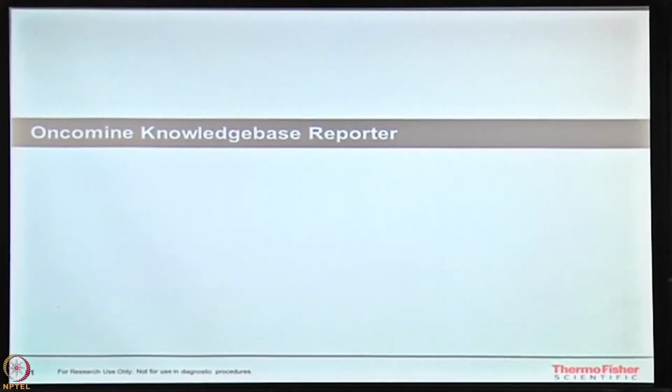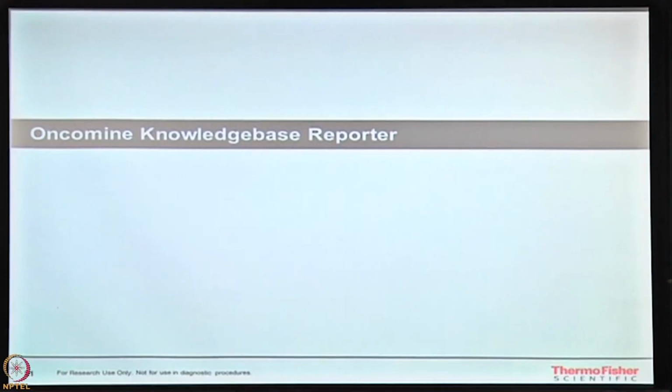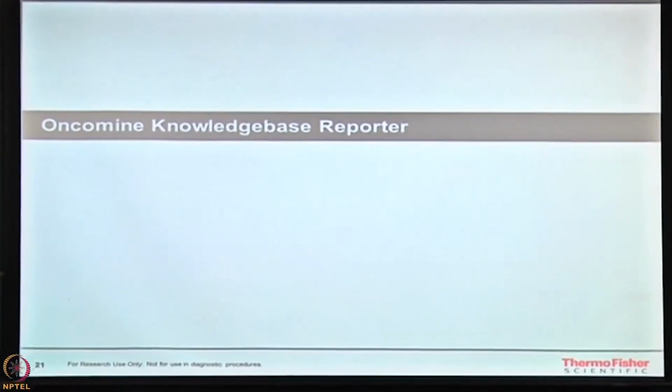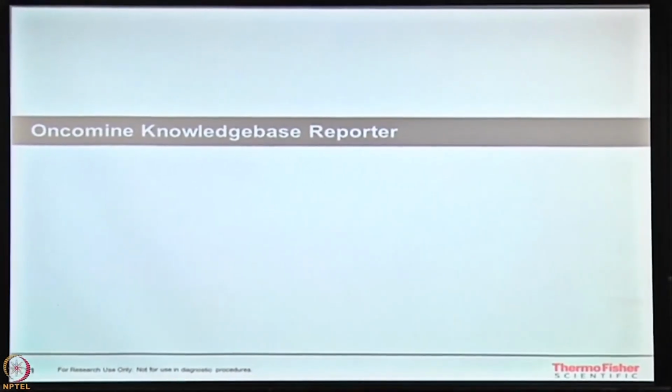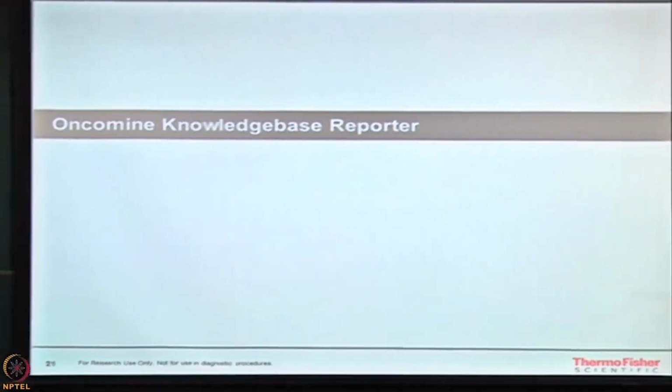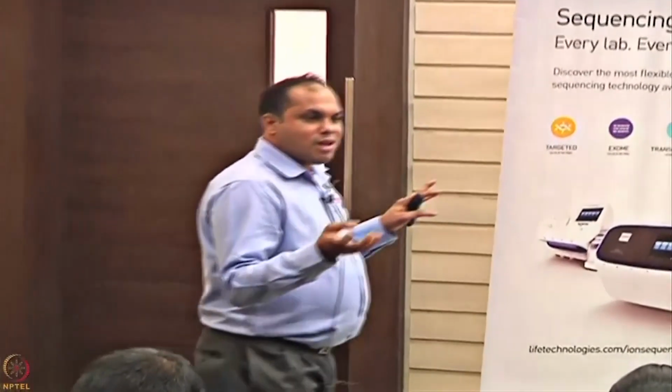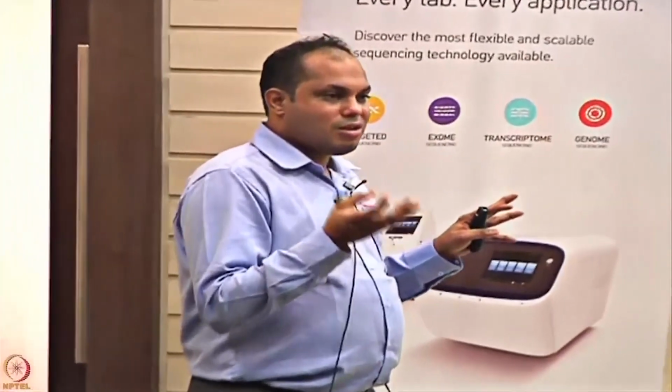And then what could be the drugs which could be available for such diseases or variants that you are getting, right? What you are doing over here is correlating your patient's sample information to the variants, getting meaningful information, and then generating the information on what type of drugs could be utilized, right? You have a DrugBank database that is correlated to this.